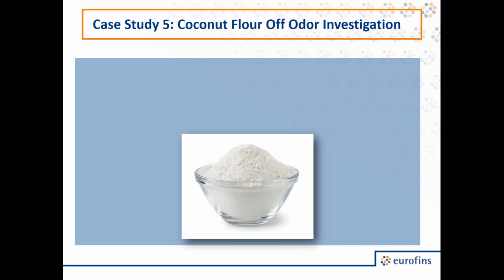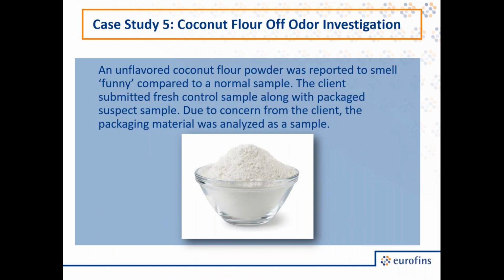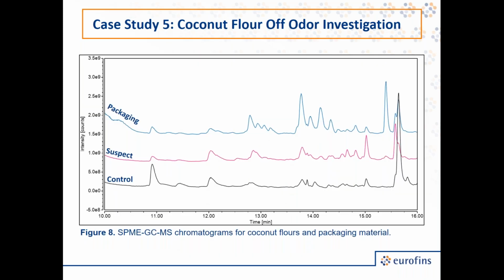For our next study, we were looking at coconut flour. This was an unflavored coconut flour powder, and it was reported to smell funny compared to a normal sample. This was during the product development stage. Our client realized they were testing packaging, and all of a sudden they had this potential funny sample smell. So they sent us fresh control sample along with packaged suspect. And since the client was concerned about packaging, we also analyzed packaging material as a sample.